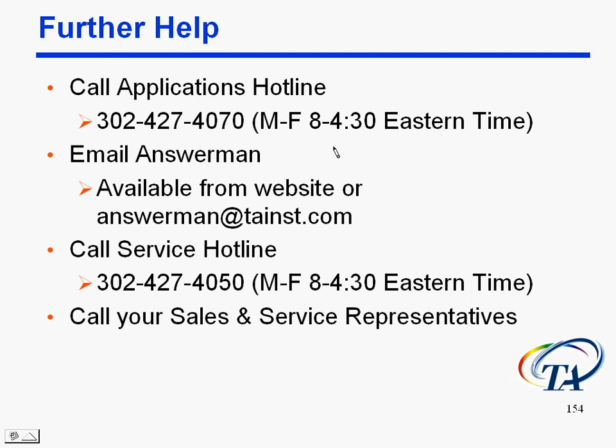You can also send an email to AnswerMan, and this is available from our website, or you can just direct it at answerman@tainst.com. There's also a service hotline, and here's the phone number and the times for that.